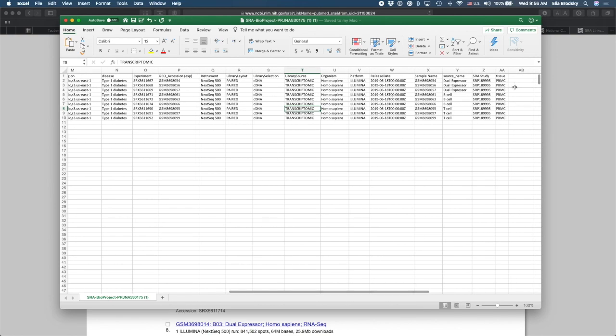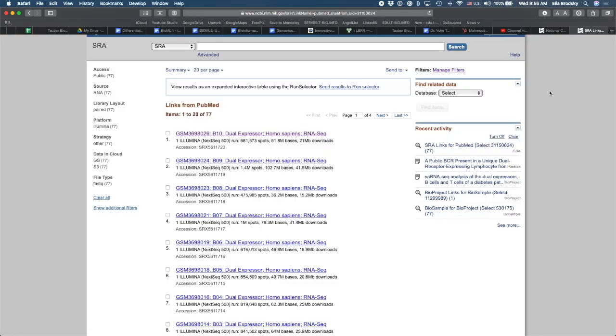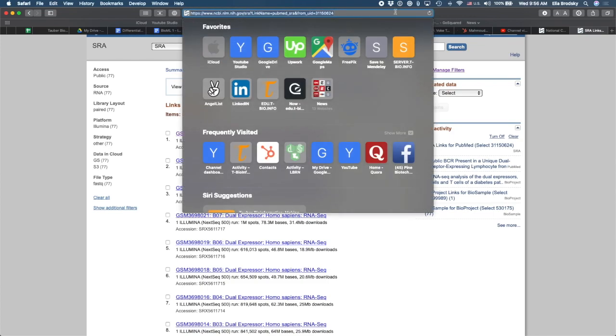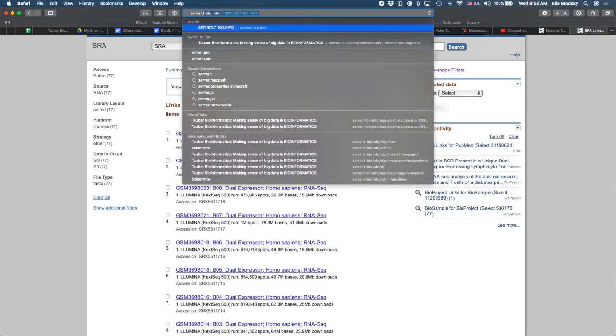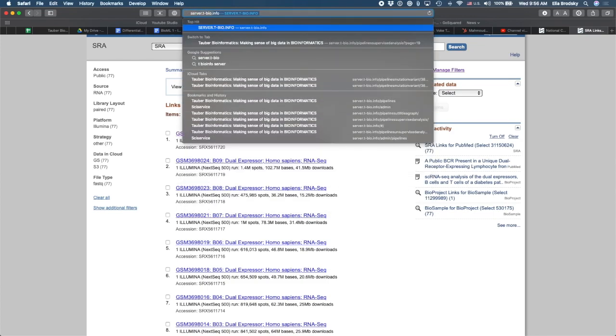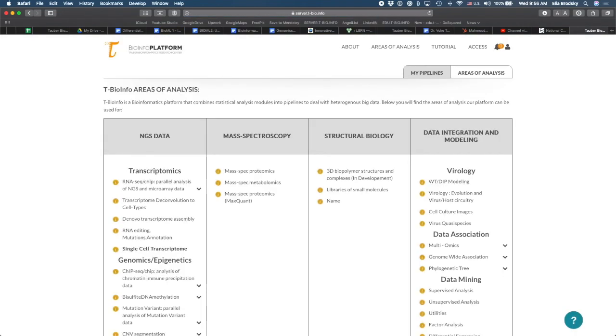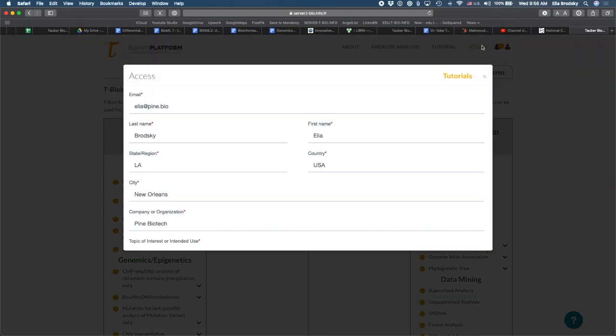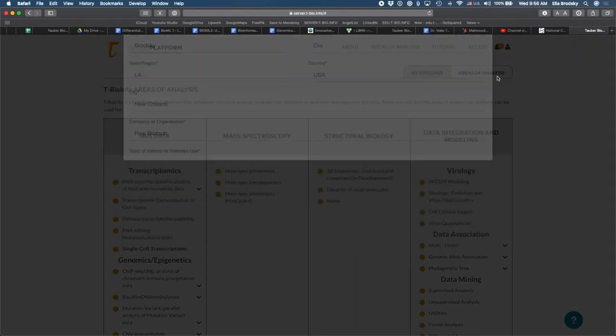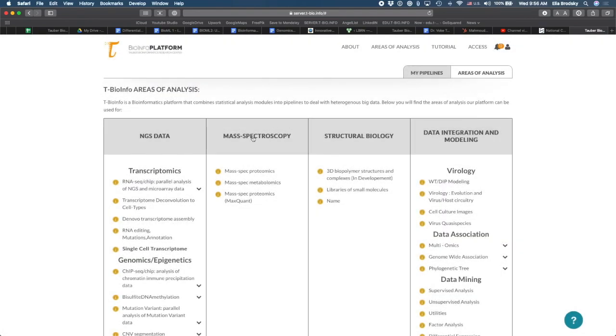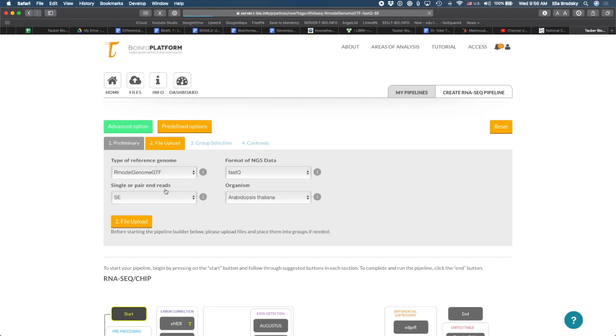And now I can go to server.t-bio.info. And I will arrive at the tbio.info platform. The tbio.info platform allows you to process these kinds of data sets easily using our cloud infrastructure. You can request an account by just going here and clicking on access and filling out this form. So I'm going to go right here under RNA-seq chip parallel analysis of NGS and microarray data. I'm going to click here.